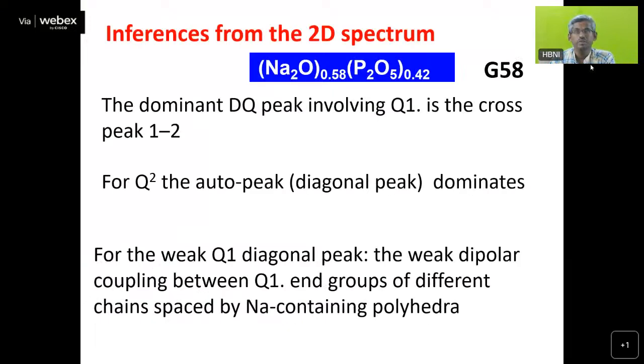Okay. So very good evening to all of you. Welcome to the 10th lecture. This is a 12 lecture course on solid state NMR spectroscopy, basic aspects of solid state NMR spectroscopy. We have discussed many points like what is magic angle spinning, what is cross polarization.